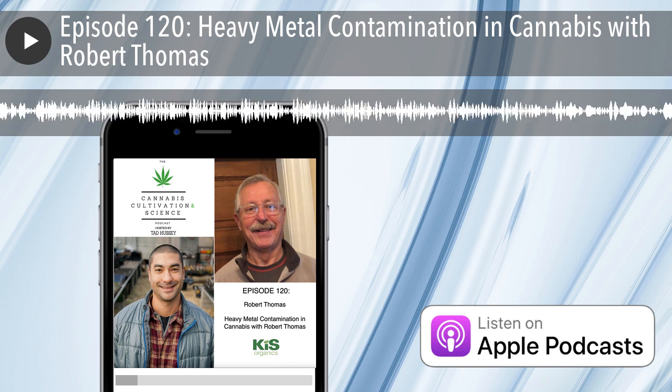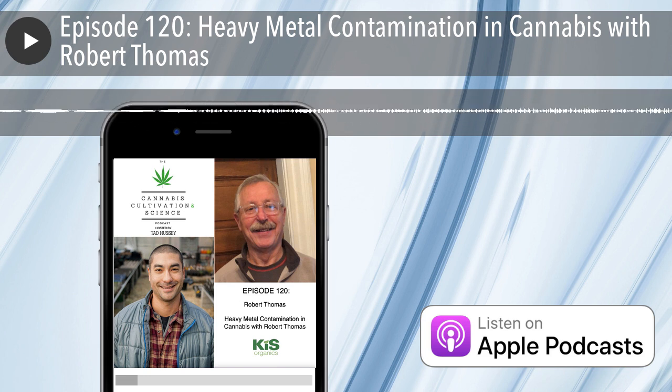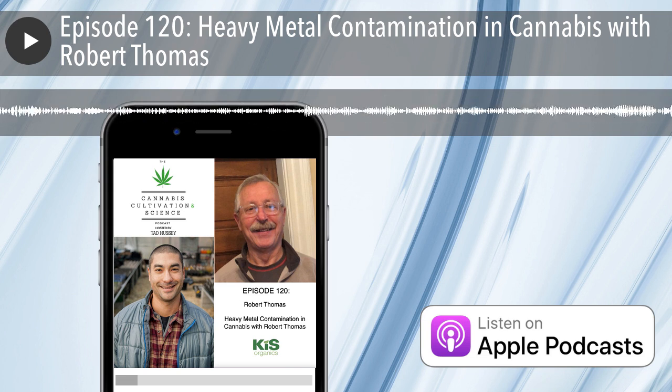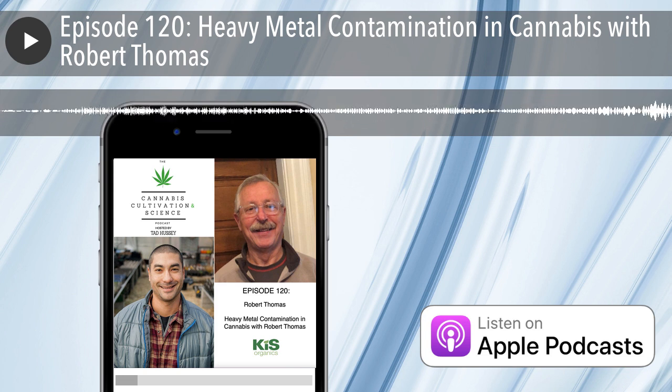Well, I think we have to be realistic that these labs are being put together very quickly. ICP-MS is an ultra sensitive technique, and some of the contamination issues are not being addressed. With the best intent in the world you can hire someone who's reasonably competent, but because you put the instrument basically in a warehouse, and they're not going into specialized rooms, you got to be aware that contamination is a huge problem for a technique that's capable of measuring down to parts per quadrillion.